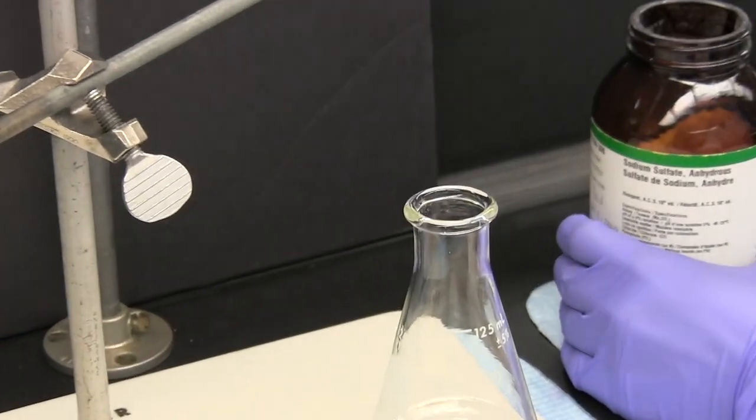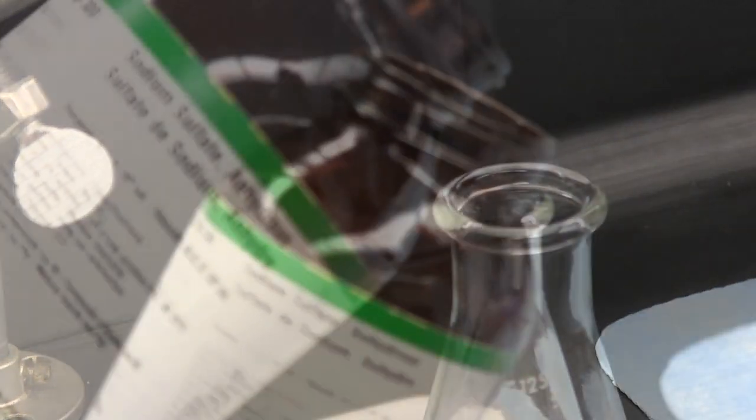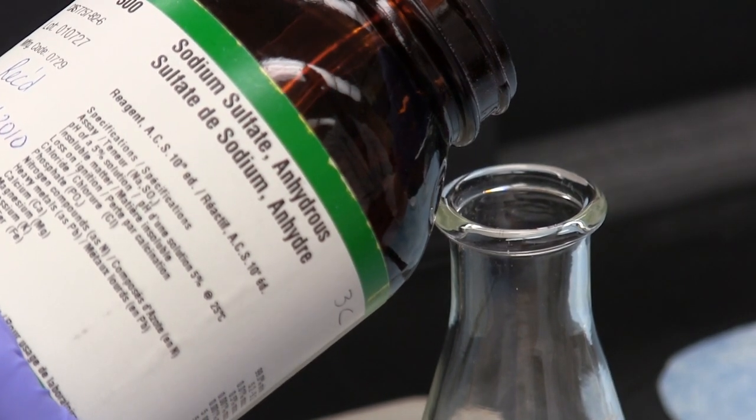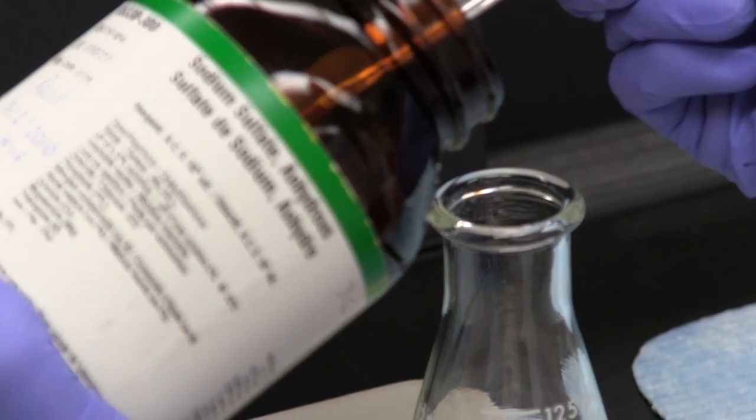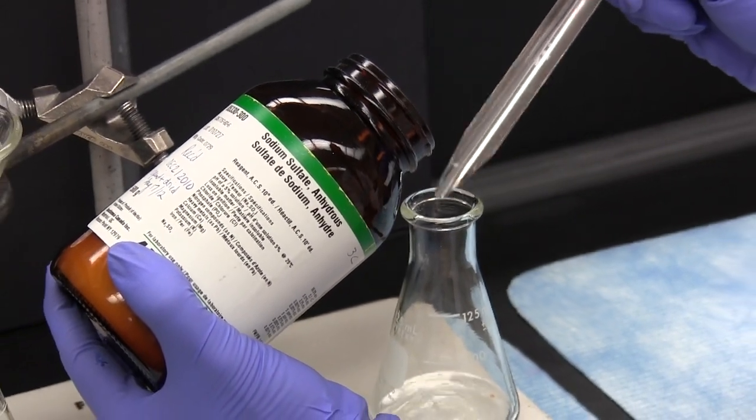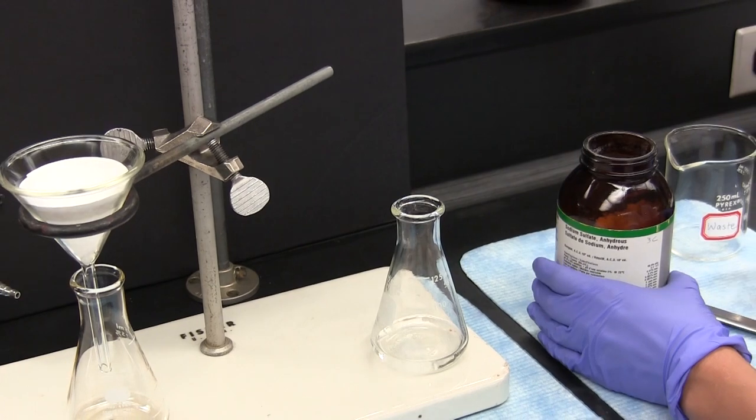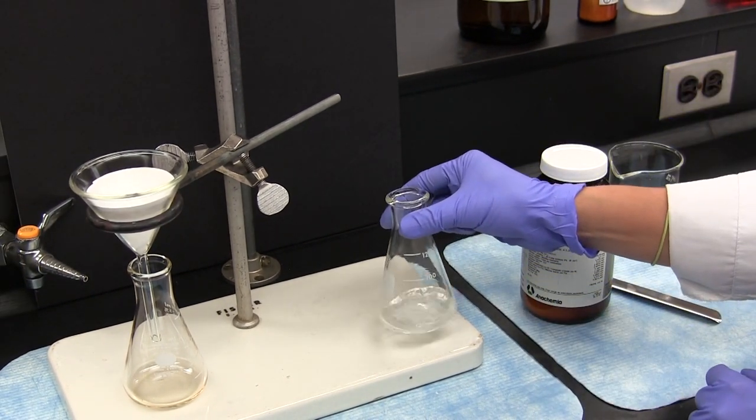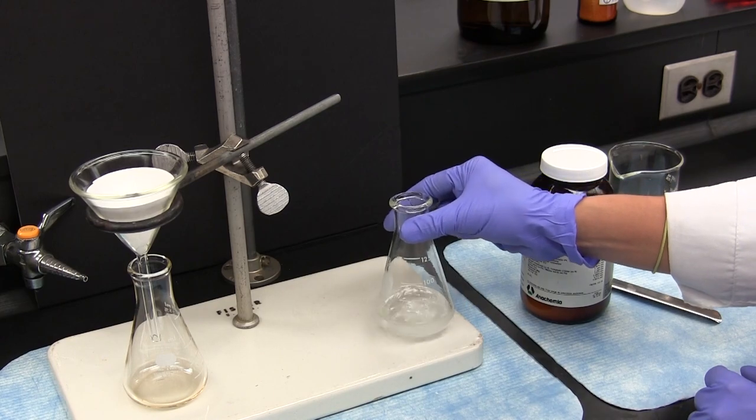Here we are going to dry the organic dichloromethane layer using anhydrous sodium sulphate and this will remove any traces of water. Other drying agents which could be used include calcium chloride and magnesium sulphate. Removal of small amounts of water is usually necessary after extraction from an aqueous solution. Follow whichever directions you are given.